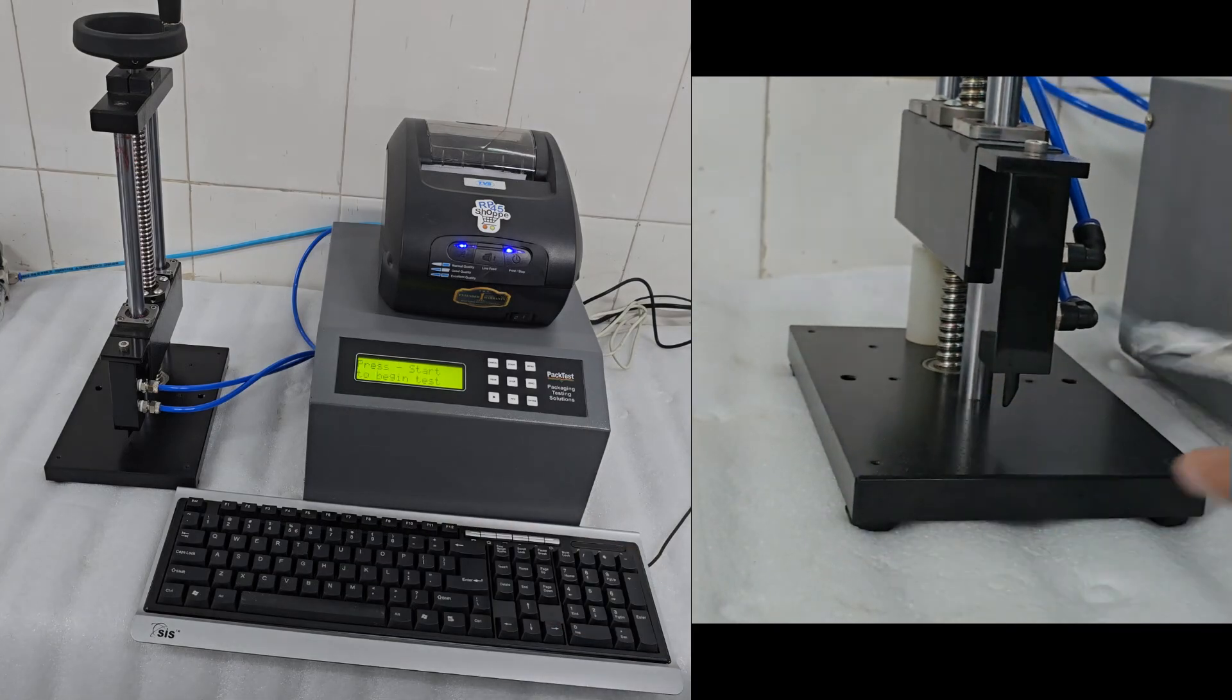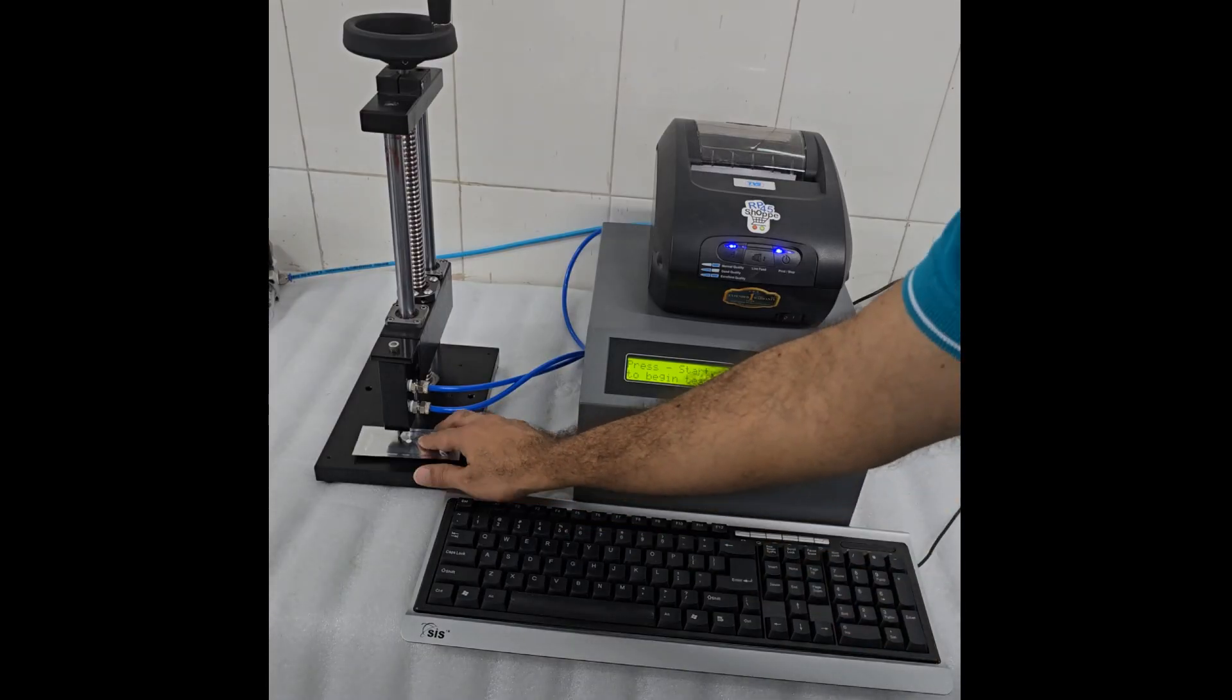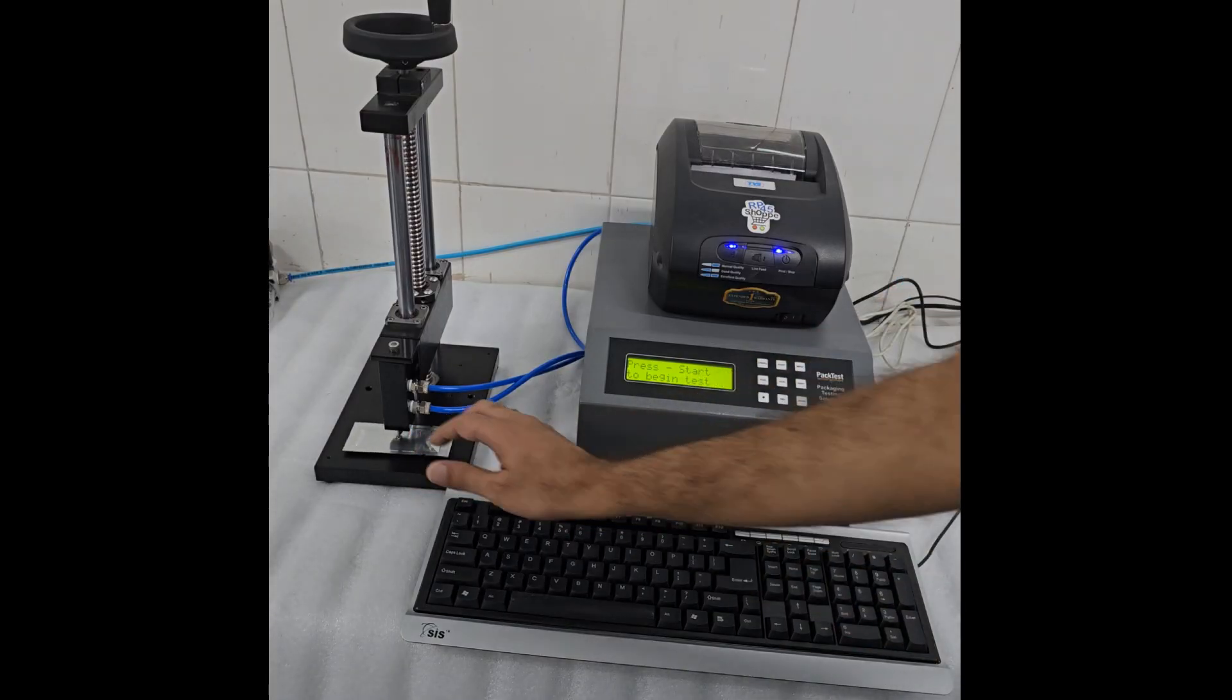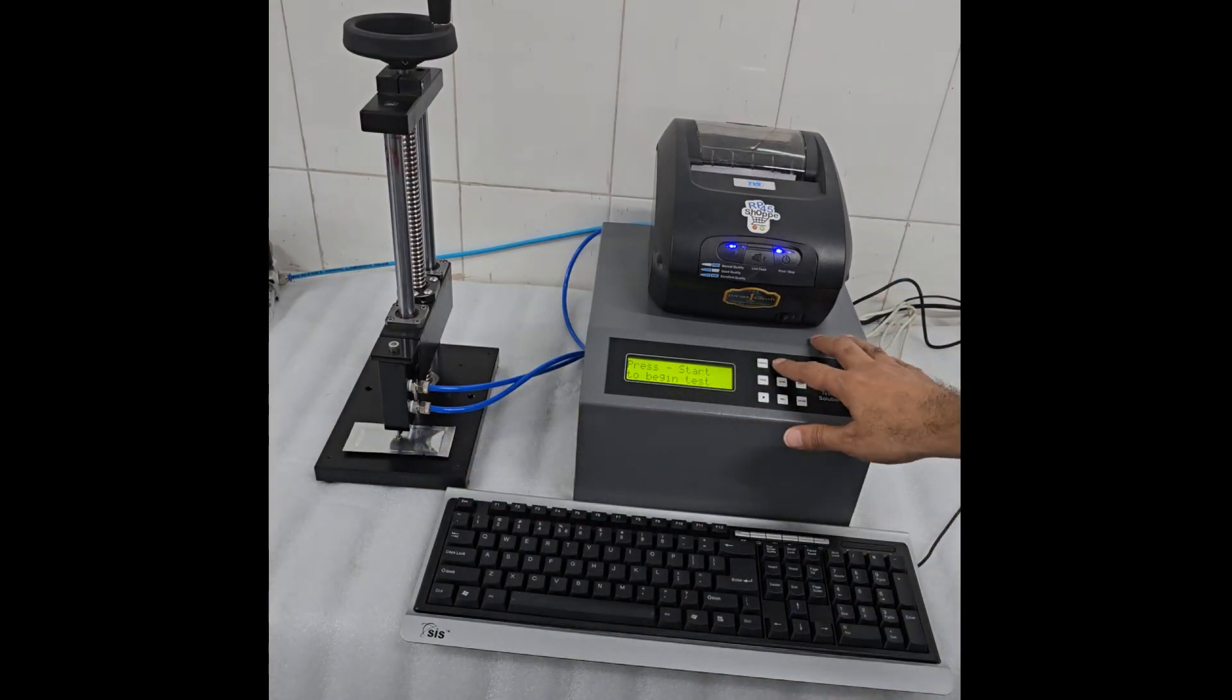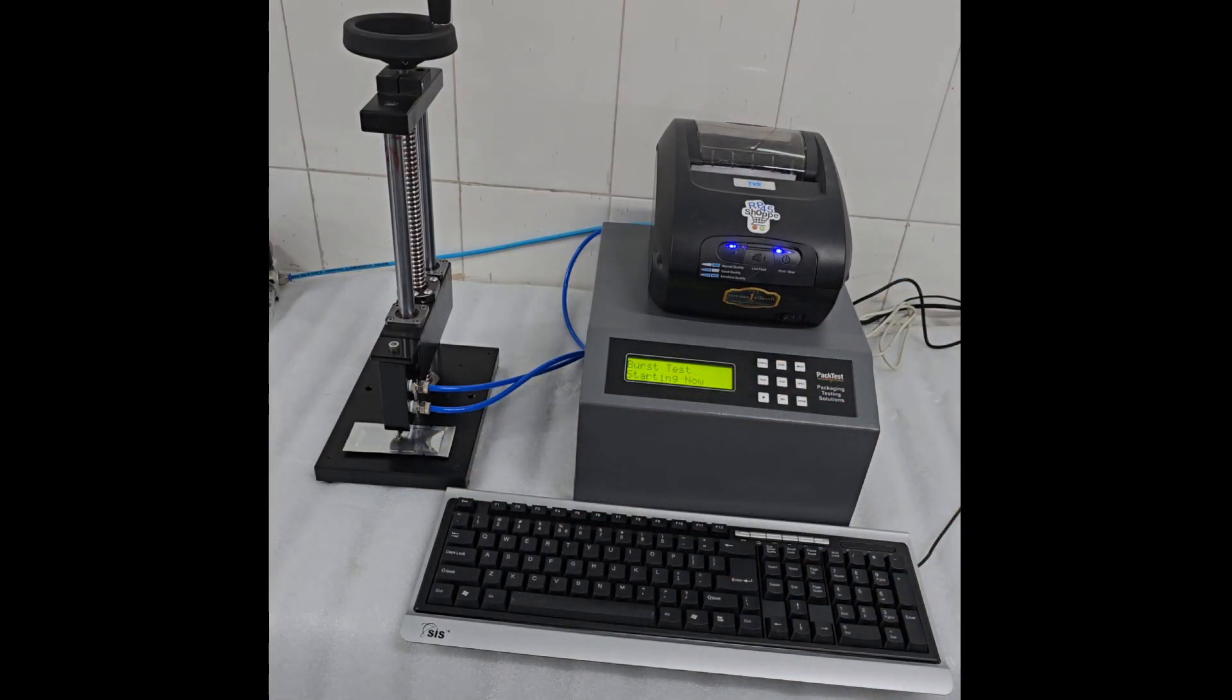The display will show sample burst, followed by test over. The result is automatically saved in memory.